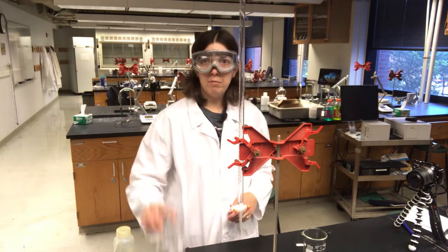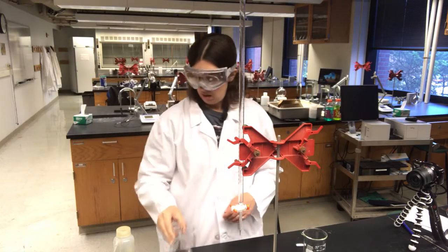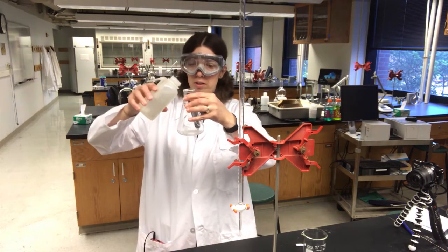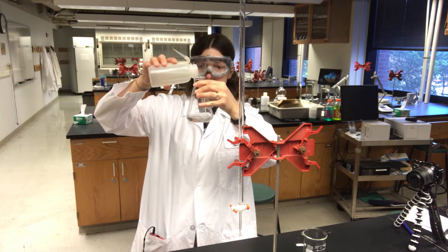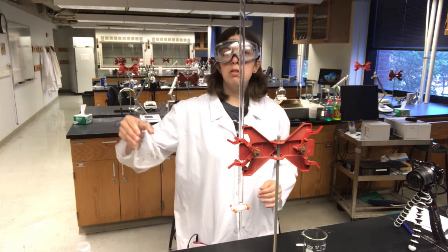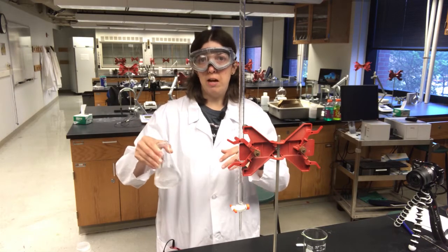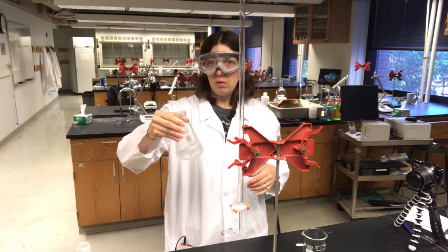I have my weighed KHP in my flask. I'm going to dissolve this in about 50 milliliters of water. It's not super important to be exact — we do not need to do any pipetting. I'm just going to use the line that's available on my flask and swirl to dissolve. I'm not going to use a glass rod to dissolve because I don't want any of that KHP to get transferred out of the flask accidentally.